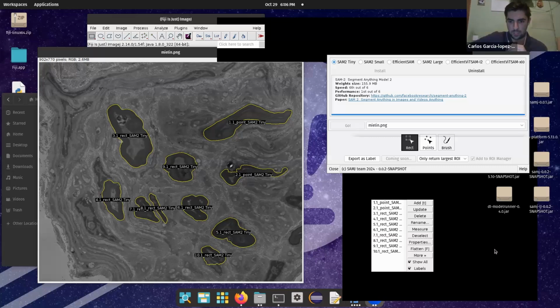Hello, Sevilla, or Daniel. Yes, we did some experiments with the negative points. It was actually available in the previous version, but I removed it because for this family of models, EfficientSAM, which is a SAM variant, EfficientViT, and SAM2, it was quite confusing for the model.